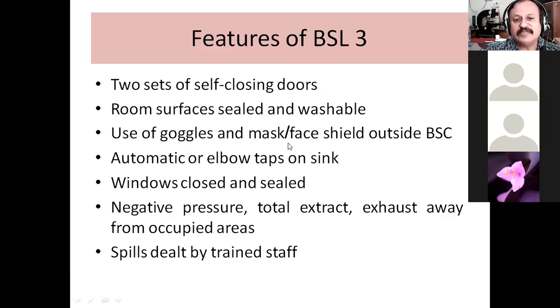Then use of goggles and face shield or mask is essential. There are automatic taps or elbow taps on the sink. Now, what are these elbow taps? Do you know? Elbow taps? No, sir.